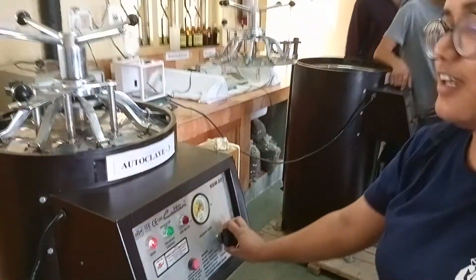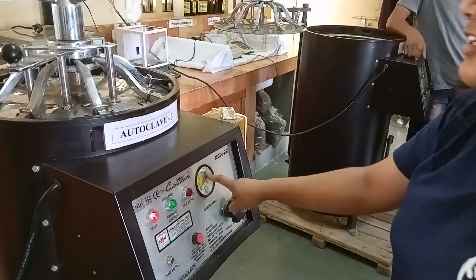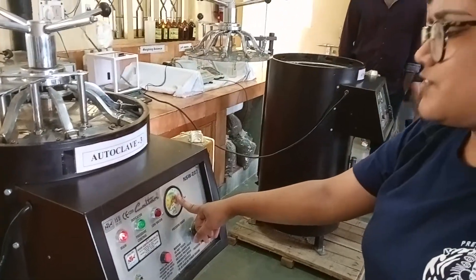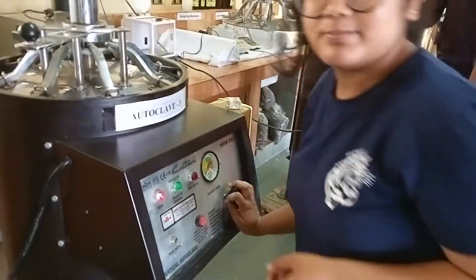Along with the steam, all the contamination will go out. Again tighten this one and wait till it reaches 1.5. After this it will give a sound, and after that you can wait for 15 to 20 minutes and then switch it off. Thank you.